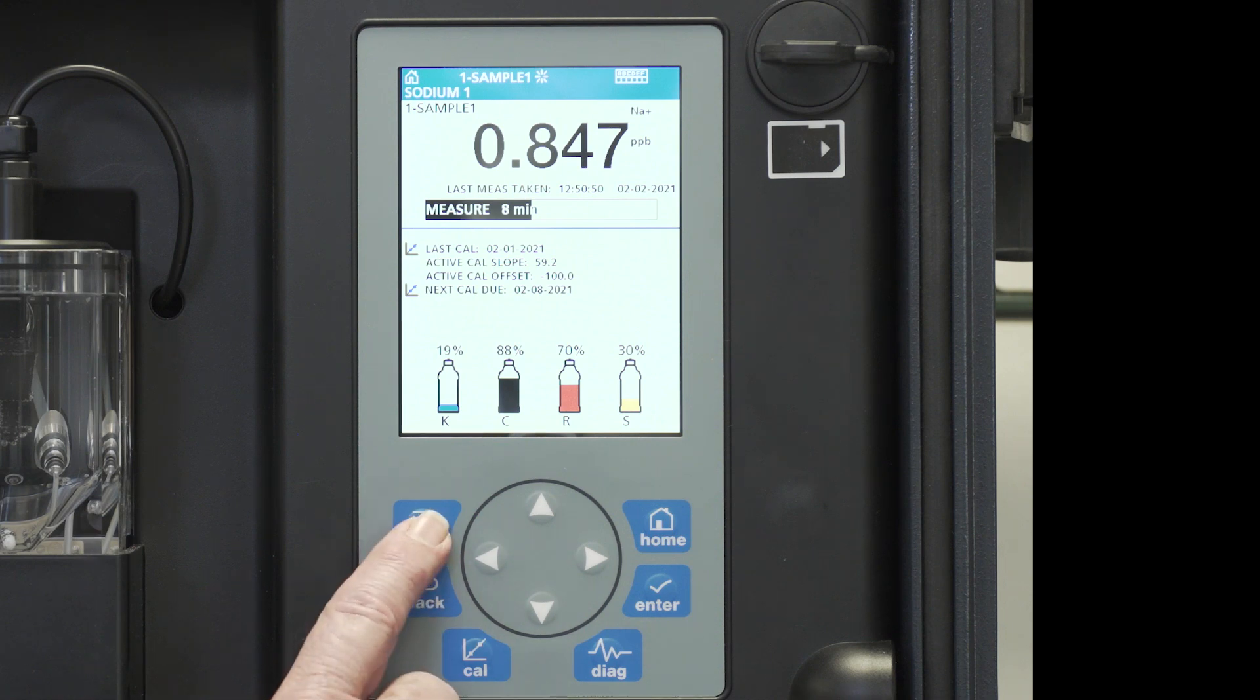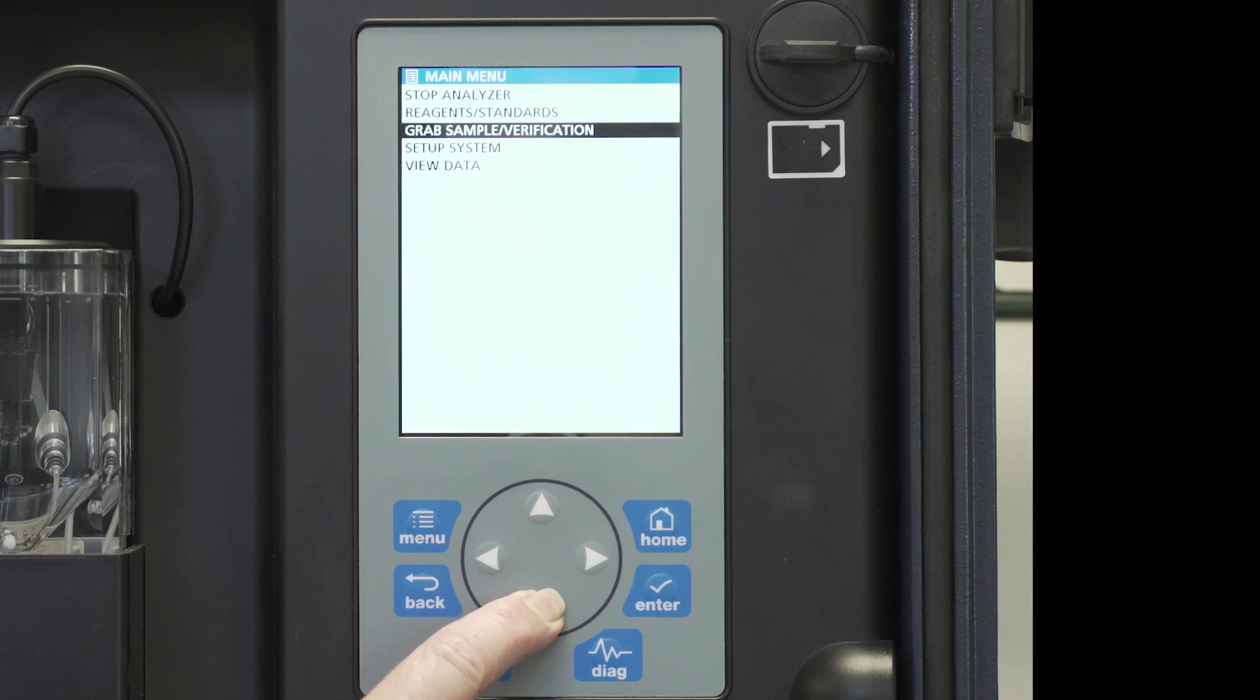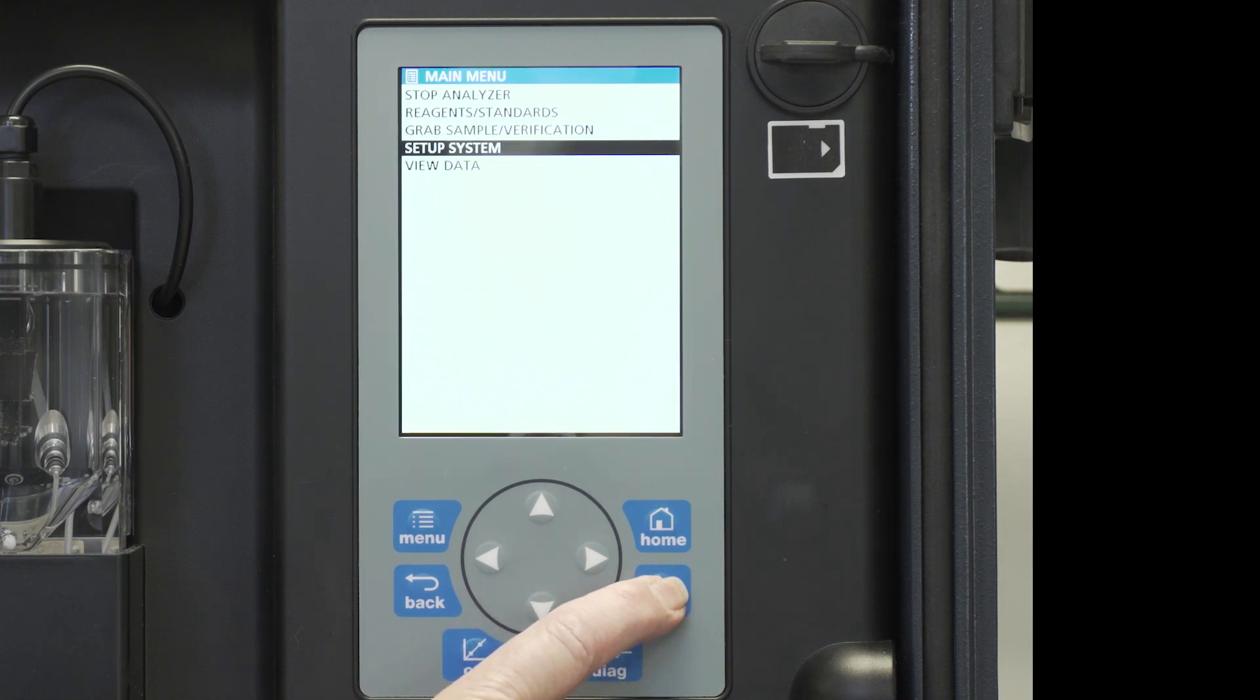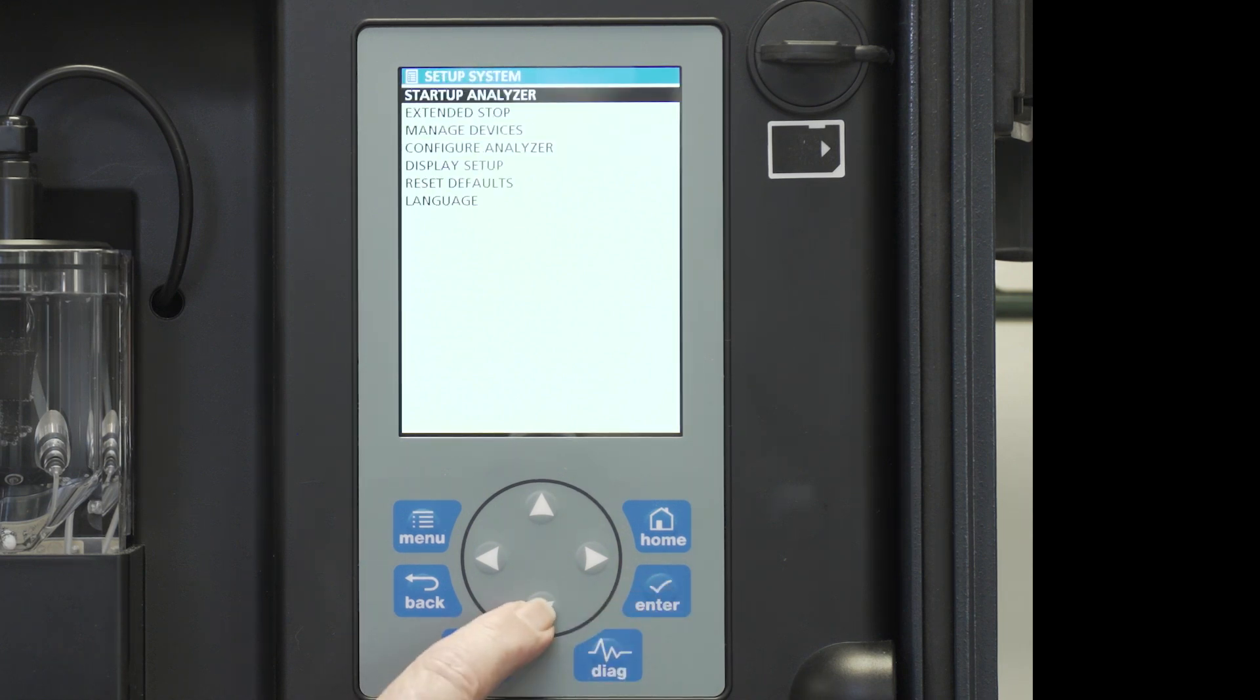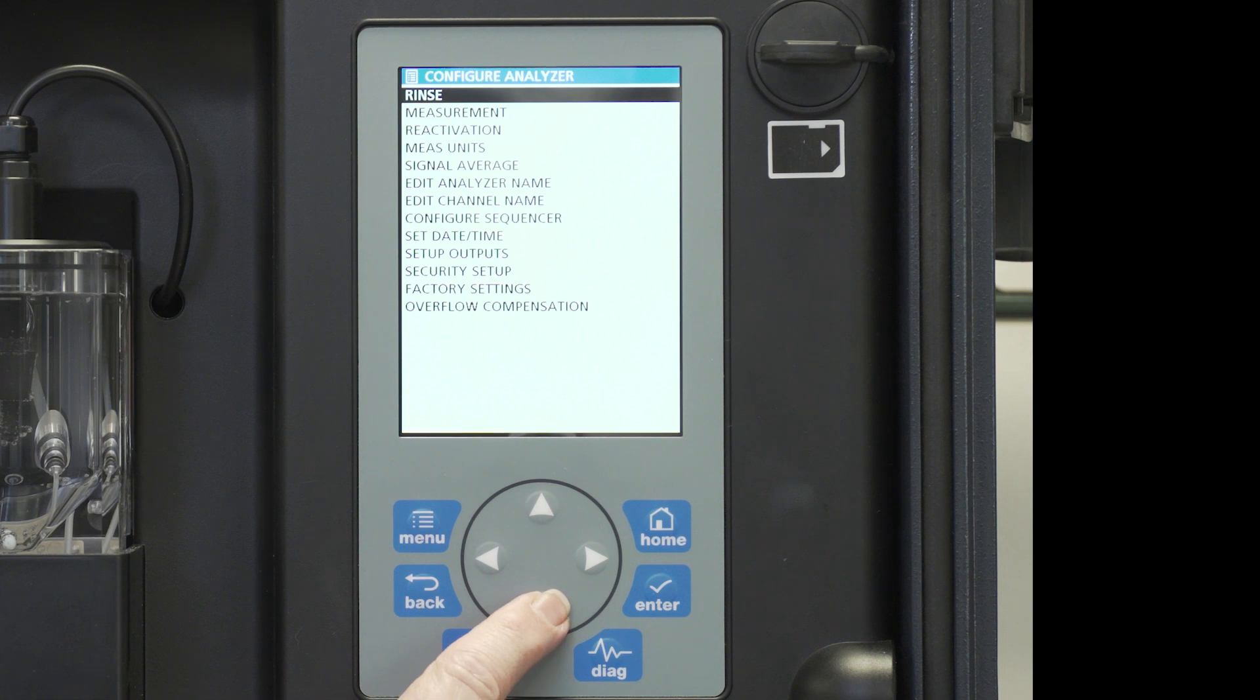We will go to menu and scroll down to system setup. Press enter. Move down to configure the analyzer. And then scroll down to reactivation.